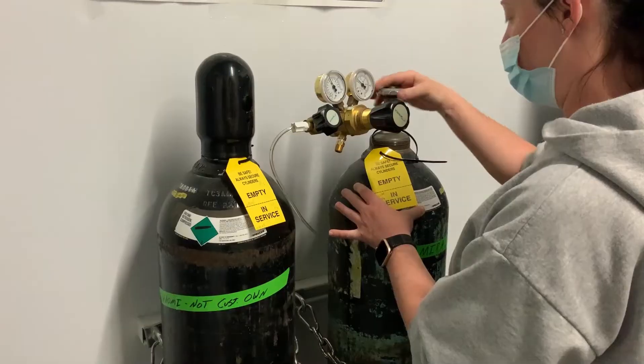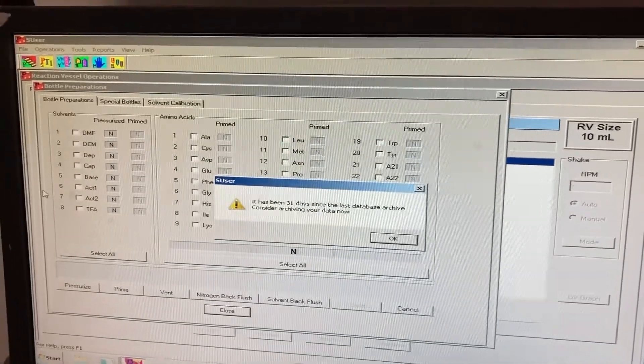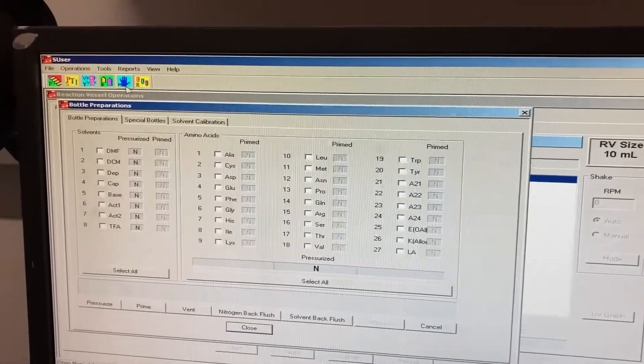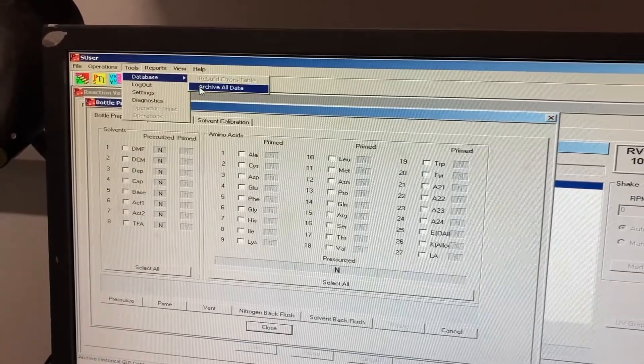The last thing you will need to do is archive the data on the computer. Sometimes you will see a notification reminding you to archive data when you open the program. Make sure you are logged in before going to Tools, Database, and archiving all data. This will only take a few minutes to complete.